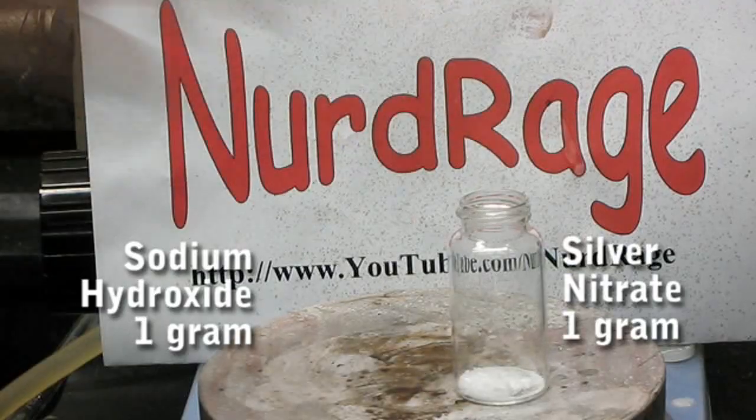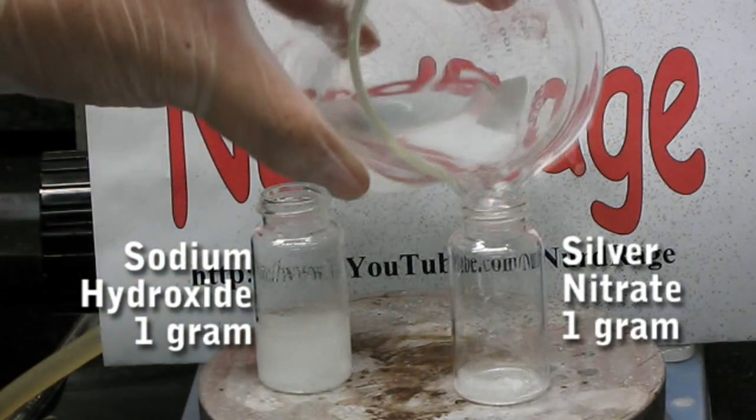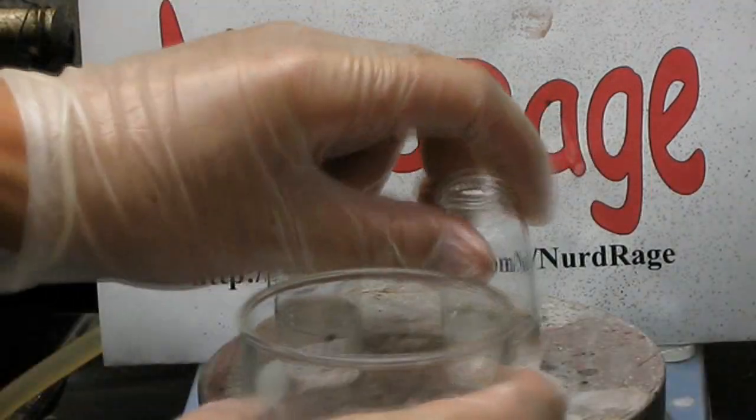First you'll need 1 gram of silver nitrate and 1 gram of sodium hydroxide. Add enough water to both to completely dissolve them, then mix them together in a larger container.